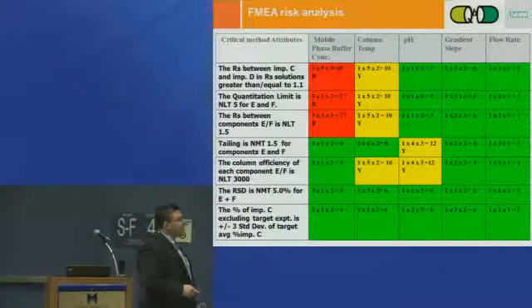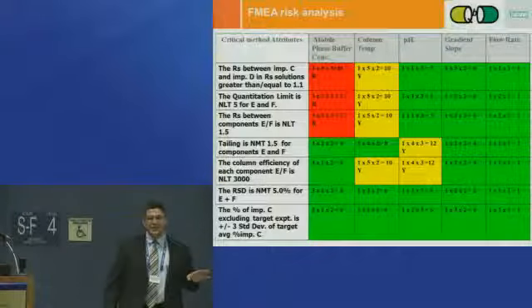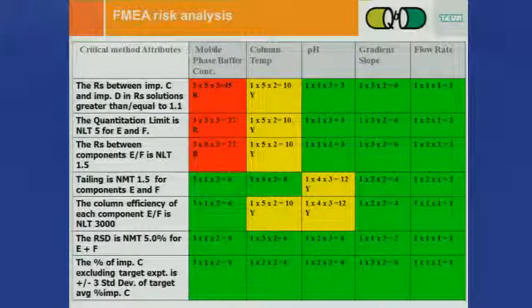Here's the FMEA risk analysis, and this is called FMEA Light. Once again, this is a very light version of FMEA. You can use this in the initial stages in your organization before a more, let's say, in-depth FMEA program is instilled. But here, this is probability, this is impact, detection. If you looked at the prior RPN scores, anything over a certain value got red, anything between 9 and 19 got yellow. But remember, anything that's red or yellow, you need to describe why it's red, why it's yellow.